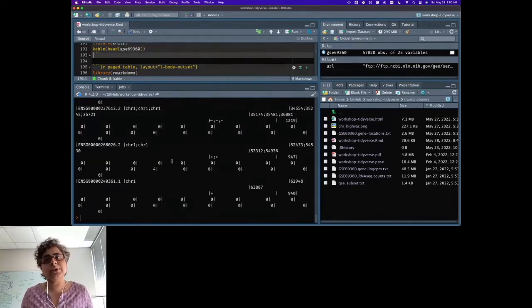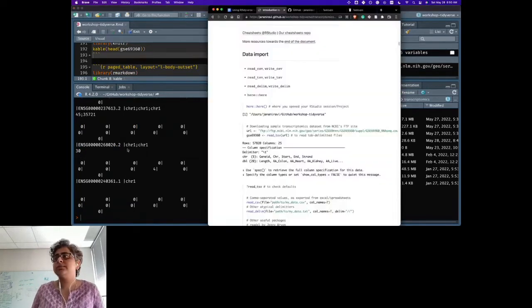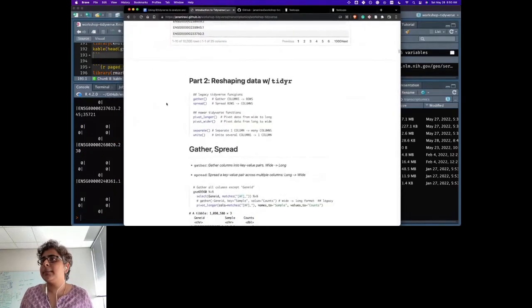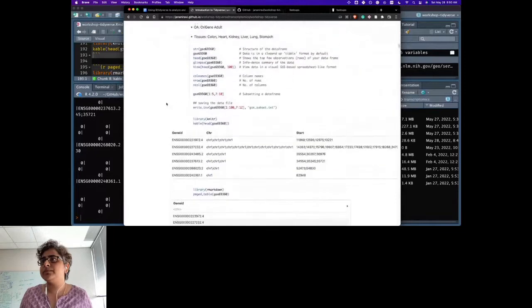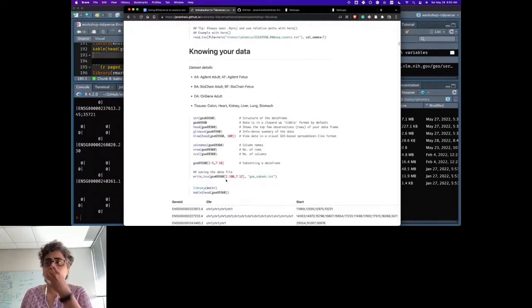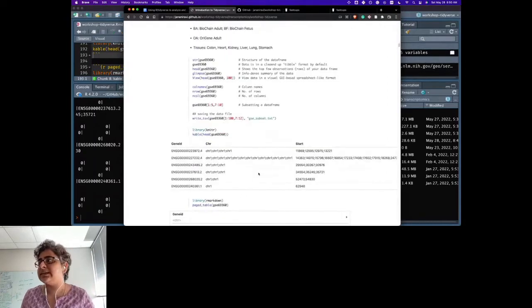Now this looks really, really ugly. And you would ask, why am I even showing you this? Well, the reason I'm showing you this is because when you render it in your HTML, all of these are very hard to see, right? All the stuff that I showed you on the screen, but here it shows me in a nice tabulated form.